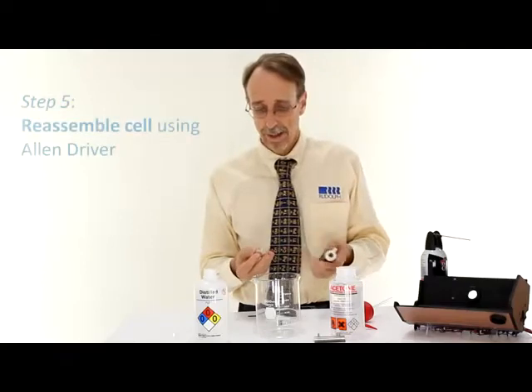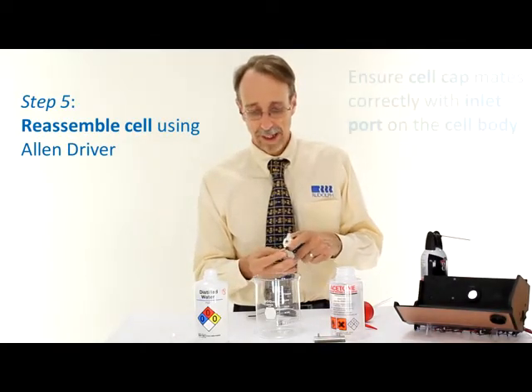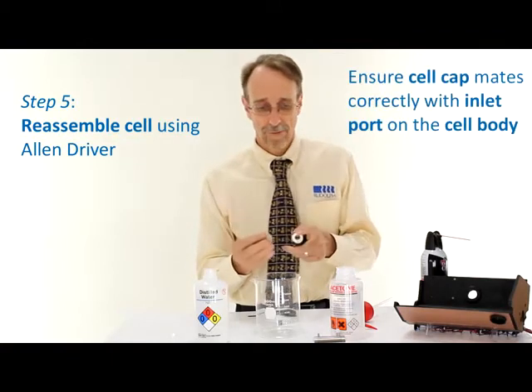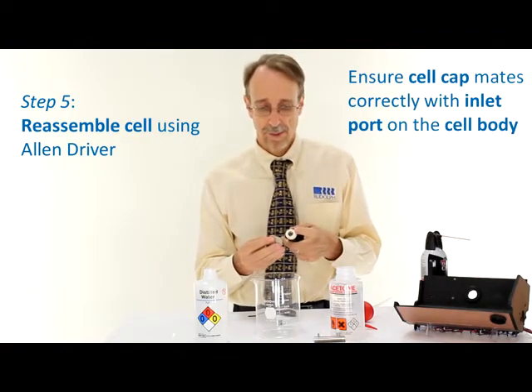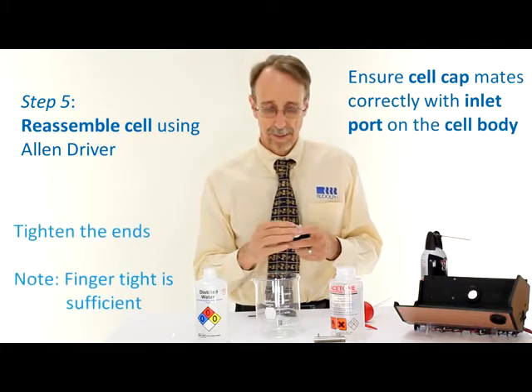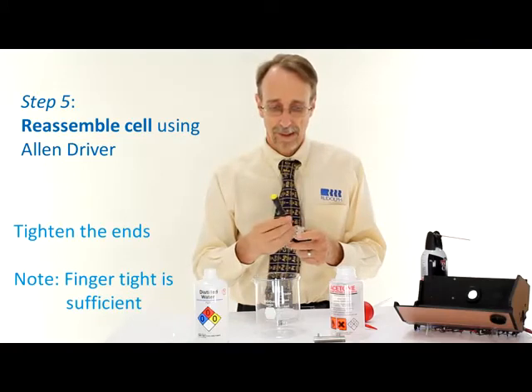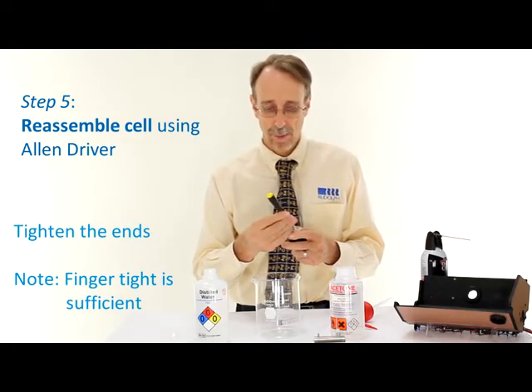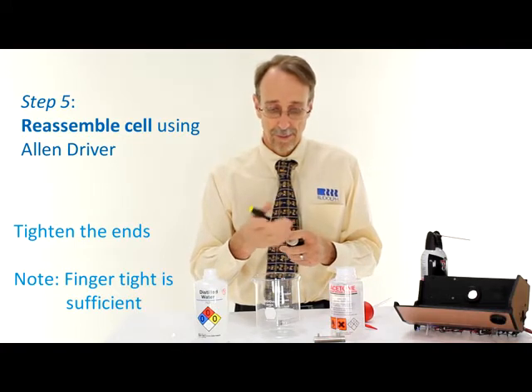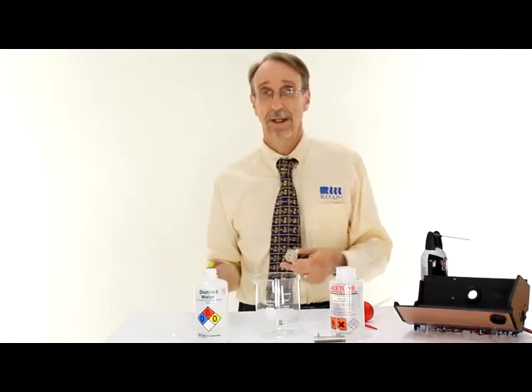Reassembly of the ends is the same process as the disassembly. It's important to remember that the ends will only go one way — the curved part on the end has to match with the inlet port on the cell. Place them over the end and tighten with the Allen driver. It's important to remember that you're tightening a glass washer, so there's no need to push down hard — finger tight is enough. The cell is now clean and ready to be used again.